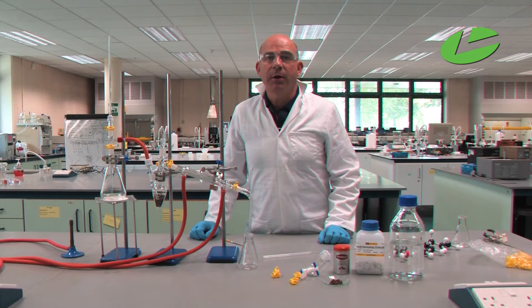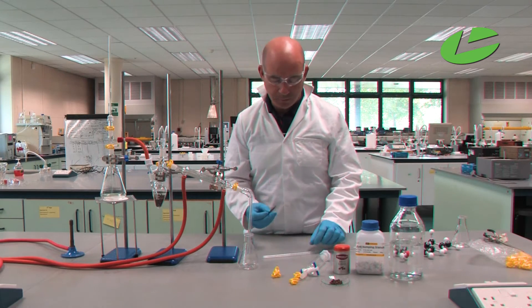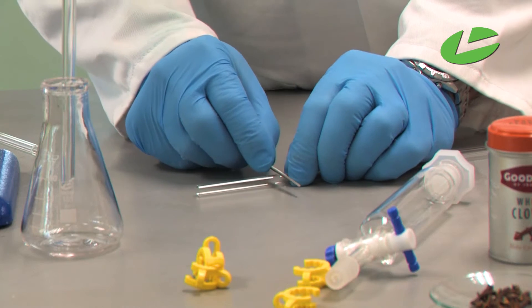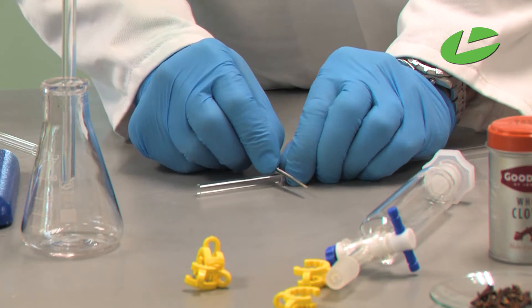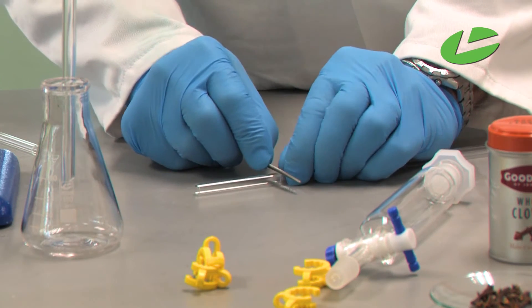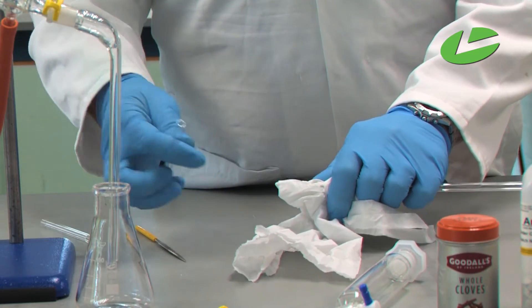I will then do an extraction using a separating funnel to extract the clove oil from the water. When putting the reaction apparatus together you may need to cut the glass rod to a specific size. I'll now demonstrate how to cut the glass rod using a very fine file. Gently rotate the glass rod while drawing the file back and forth, and once you've scored the entire circumference you can snap it — wrap a piece of tissue around the glass rod and gently snap.